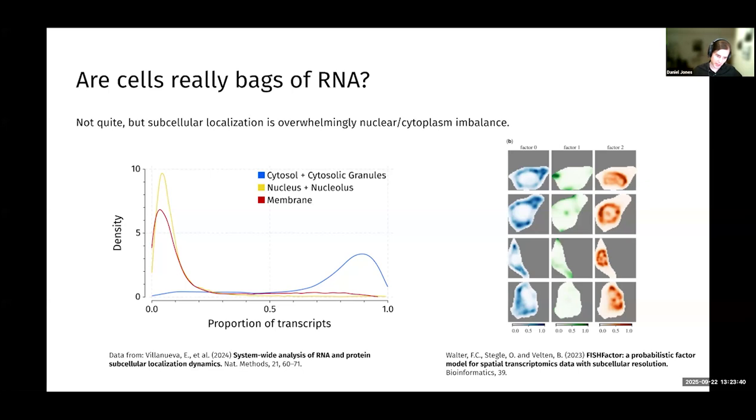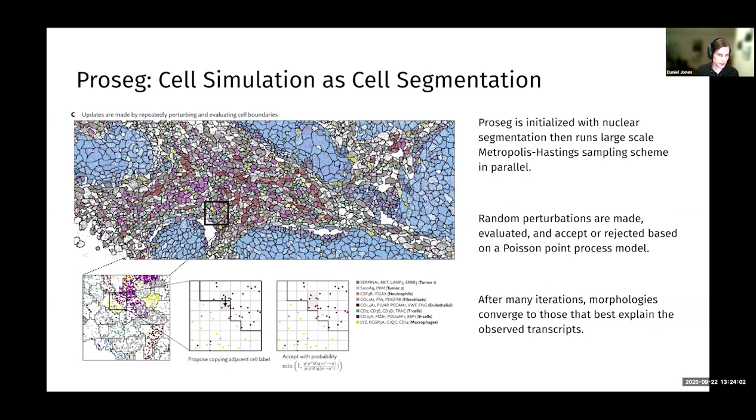That's a case where all of the RNA is highly localized, which is problematic for this model. There are other cases like neurons, which are problematic for every model, but I think particularly have some sort of global RNA localization going on.